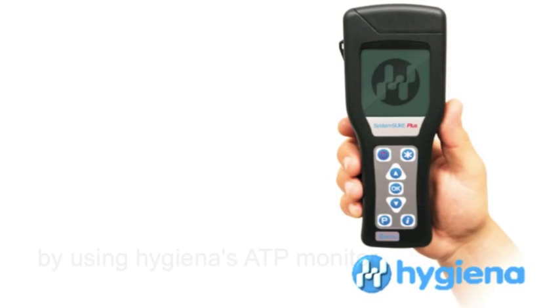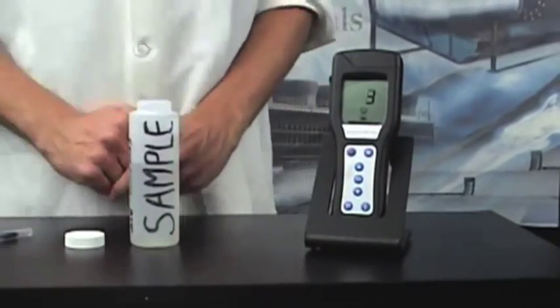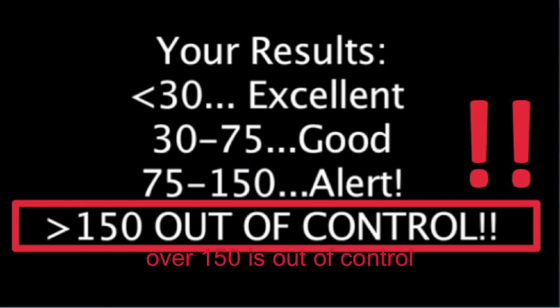This video tests bacteria amount by using Hygiena's ATP monitor. Test results come in 15 seconds and the result is shown on the screen. Below 30 is safe; over 150 is out of control.